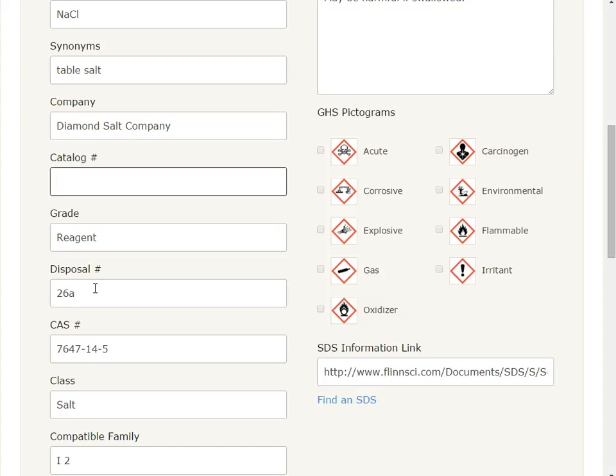If you've got a bunch of materials left over from doing a lab that you're not going to put back on the shelf because they've been used and they're not appropriate to use again, you have to dispose of it. And how do you do it? Well, there are probably a few different choices, and a lot of times it's not okay to throw it in the trash. Flinn gives you some guidance about the things that are okay for landfill disposal, things that are okay for drain disposal, or the things that have to be handled specially and taken away by a chemical waste company.